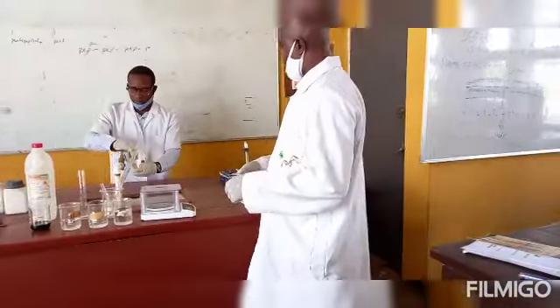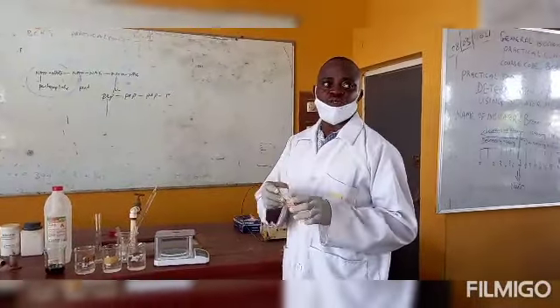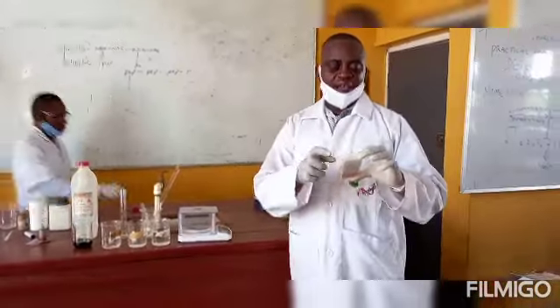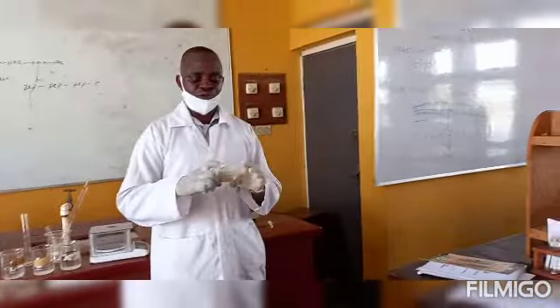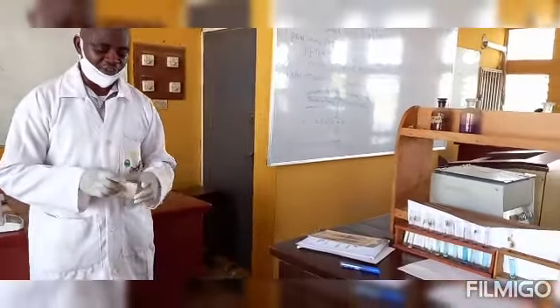And I'll show you the universal indicator paper. Also, this one too can be used to estimate the pH of solution directly. And the method we use here also today, color matching method, is also what is involved in using the universal indicator paper.